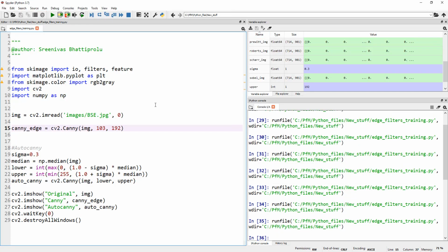I apologize for this long tutorial. I was hoping this would be less than 10 minutes, but obviously it went over. But I hope you find this to be useful. Again, there are many varieties. If you just want the simple solution, just use Sobel. Canny seems to work very well, but again, you need to fine tune your parameters. Auto, in a way, kind of gets you there, but still you need to fine tune it to make sure you're getting the desired result with your approach.